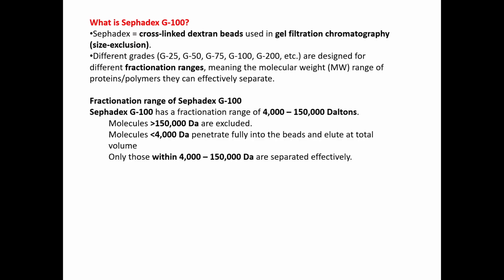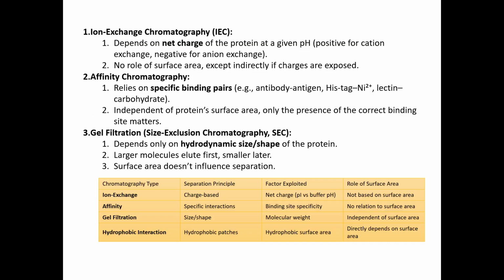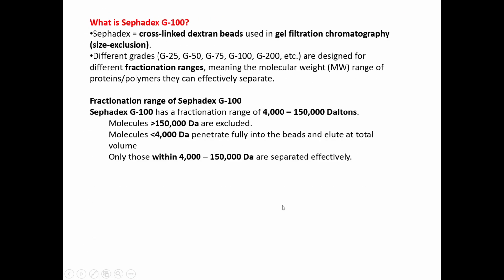Like we discussed, there are Sephadex, Sephacryl, Superdex, etc. So like I said, you can also alter the pore sizes. Let me just show you this picture. You can also get different pore sizes in your beads depending on the type that is used. That is what is here, the G25, G50, G75, G100, etc.